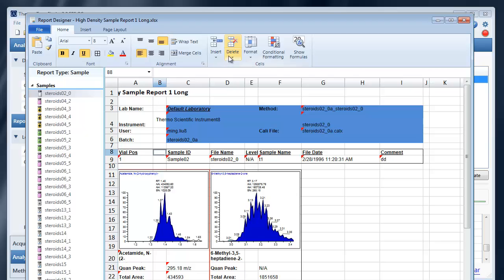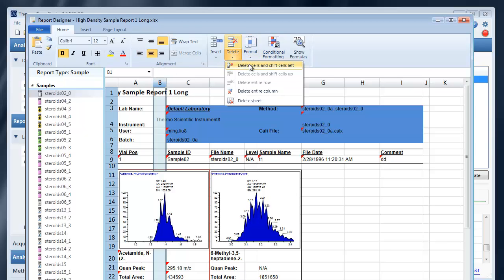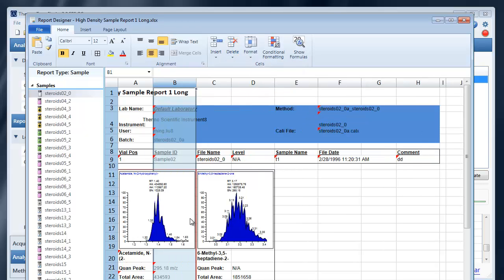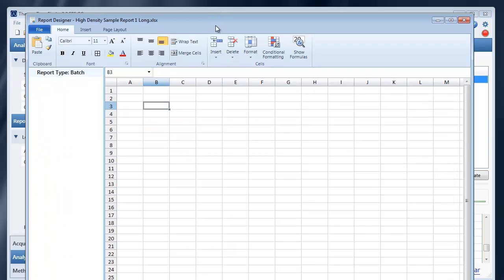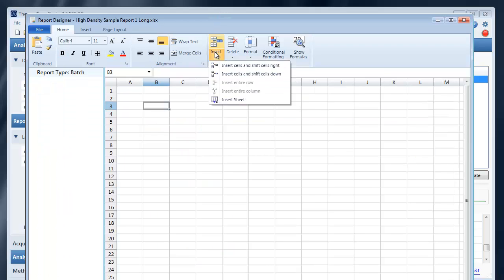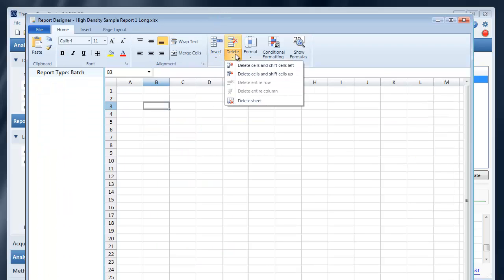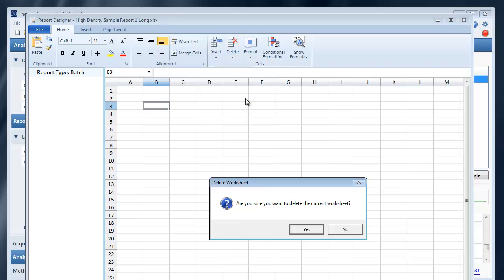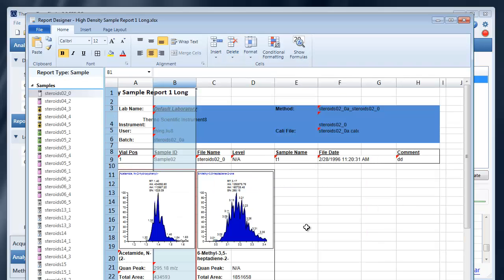You can delete a row or column. Or if I wanted to delete an entire sheet. You'll notice it works very much like Excel.